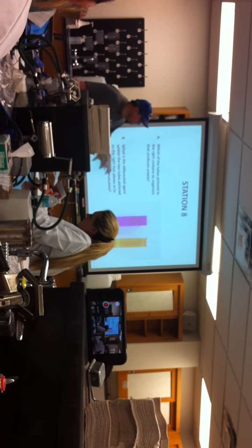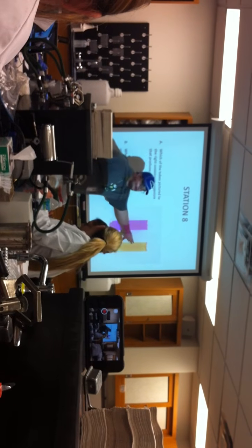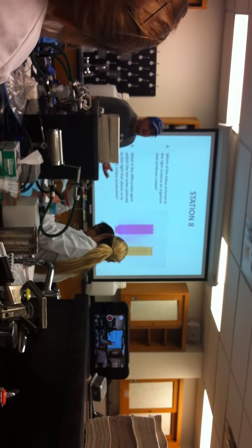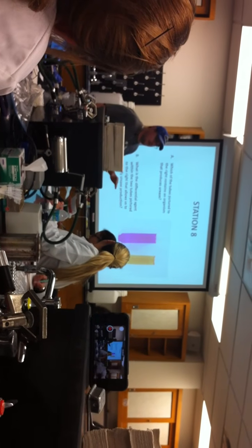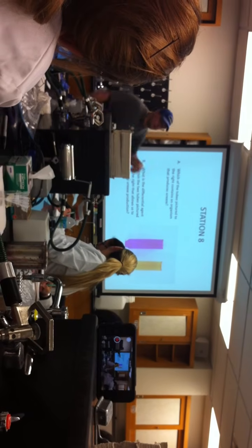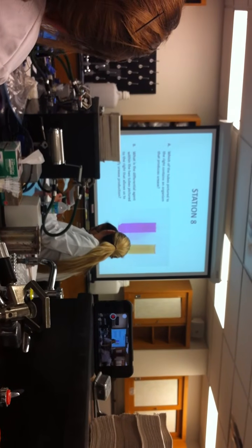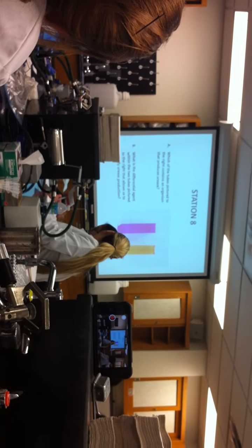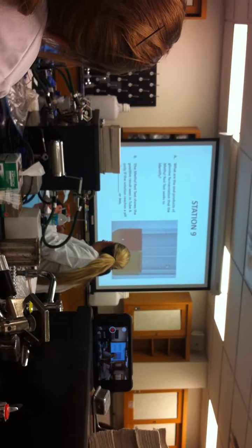So you're looking for the ability of bacteria to produce urease or not. Okay, so the tubes have urea. That's the differential agent. That's all they got. You add bacteria, and the bacteria produce that enzyme that can break down urea. You also need to know the pH like we talked about. Please do not hang up on that.